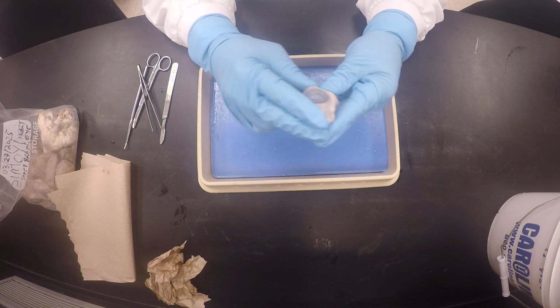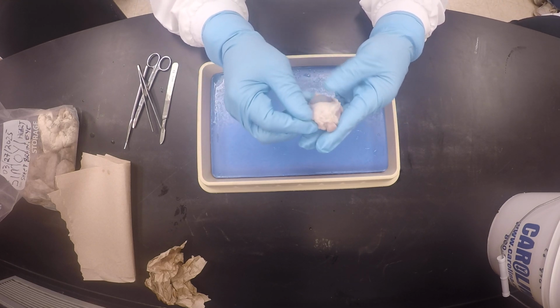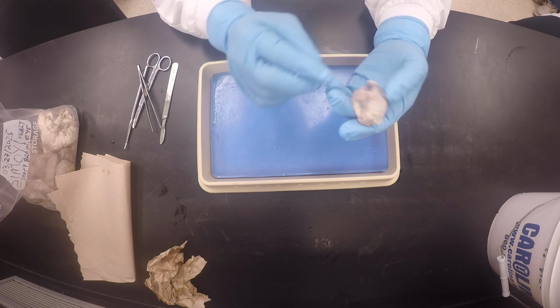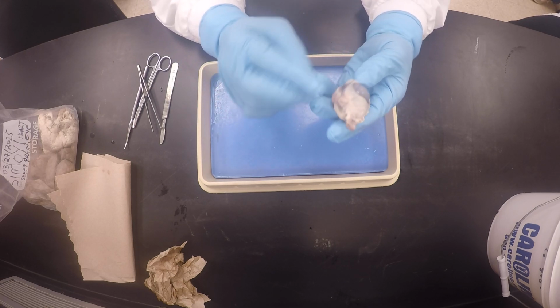So we kind of found a good eye. Sorry it took a bit long, but we wanted to find one with all the muscles. So, we look at the short side. That's what you start off with.